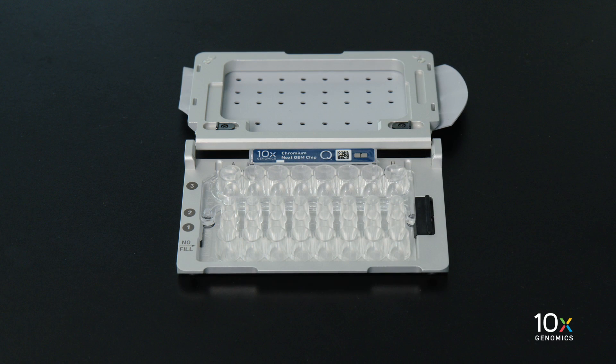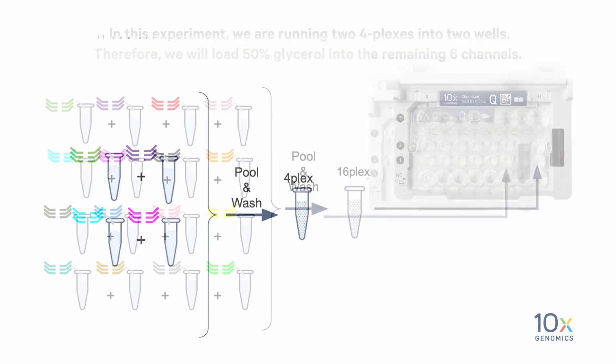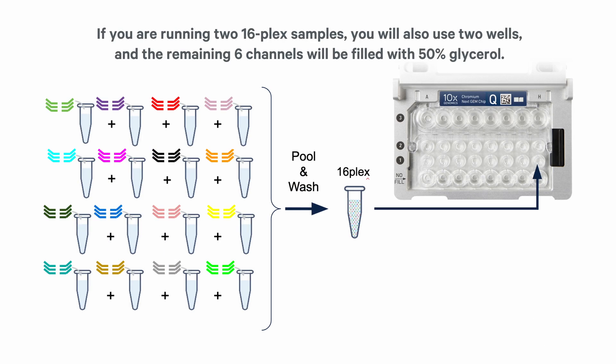We are ready to load reagents into the wells. Now we will load 50% glycerol into any unused wells in the chip. In this experiment we are running two 4-plexes into two wells, therefore we will load 50% glycerol into the remaining six channels. If you are running 2 16-plex samples, you will also use two wells.